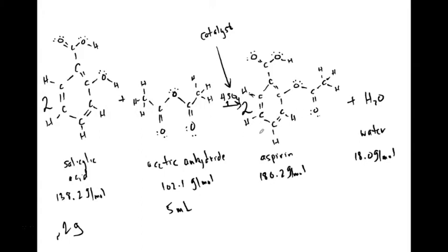And then we're going to collect our products using filtration, very much like we did with the calcium phosphate, except we're going to use vacuum filtration or suction filtration, whichever way you want to call it. And that should get us product a lot faster than we did with the calcium phosphate. That gravity filtration takes a lot longer than vacuum filtration.